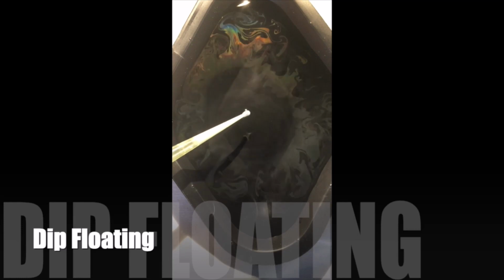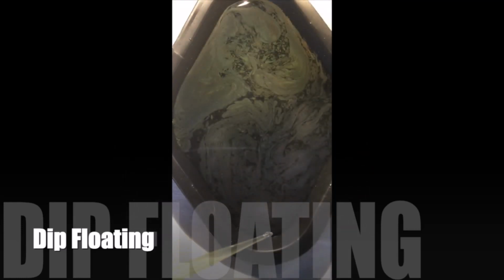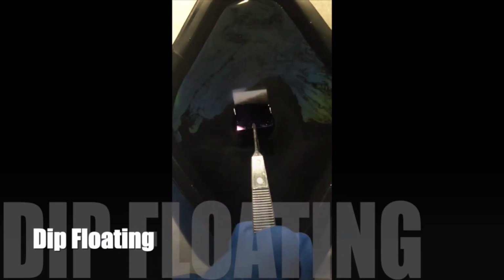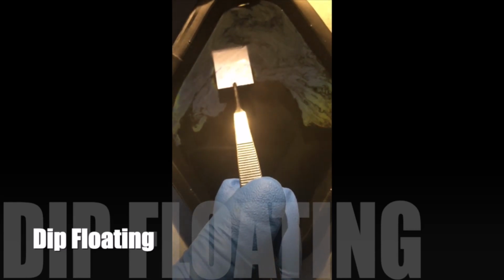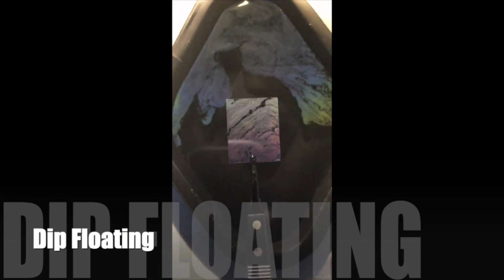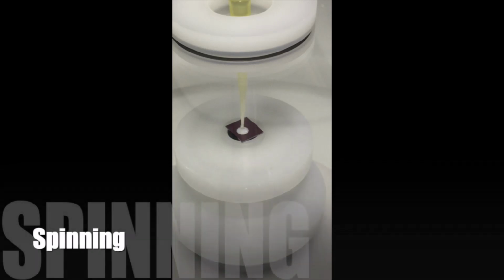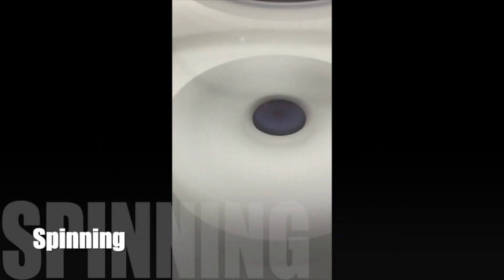Dip floating is the first one and consists in the water dispersion of a nanosphere solution in ethanol. By adding a proper surfactant, the nanospheres are packed by a self-assembling process on the surface, and the monolayer is coated by dipping the substrate as shown. Another technique is spinning a drop of nanospheres directly on the substrate, and the high speed allows the nanospheres to arrange as a monolayer.